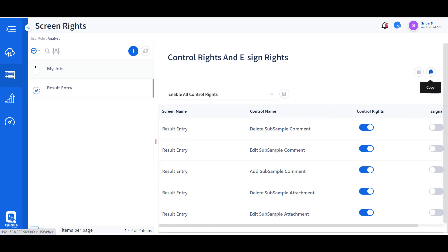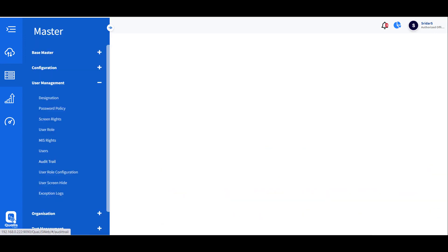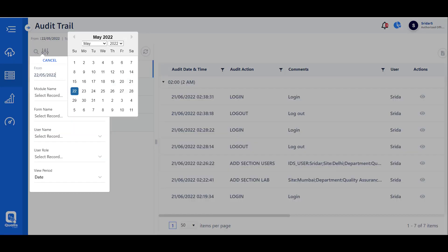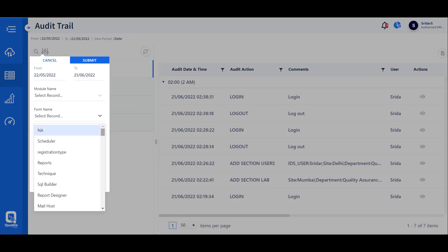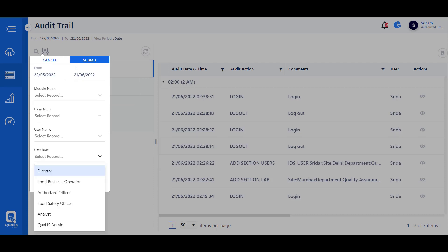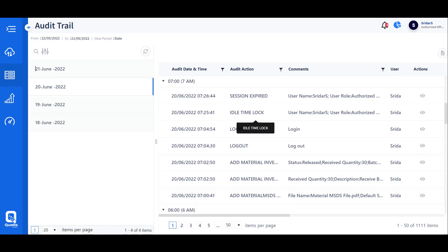Electronic signature can be enabled, allowing reviewing of work with input of comments and an electronic signature. This also ensures that the audit trail is actively captured. The audit trail module captures every single activity performed in the application, including user details, timestamp, old values, and new values.